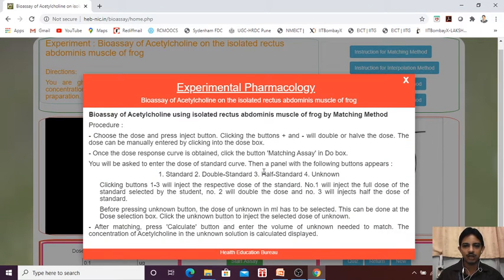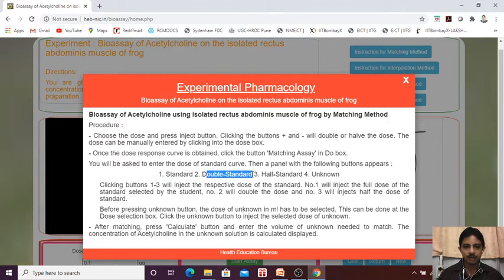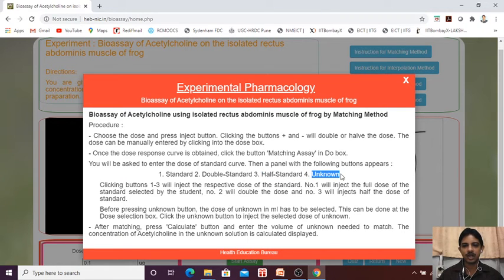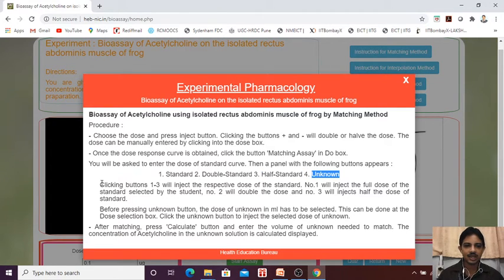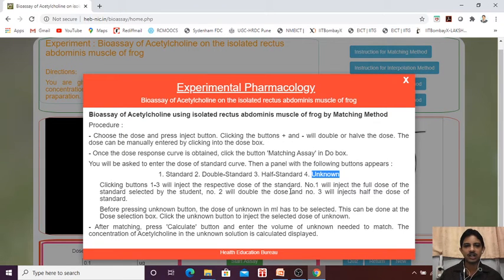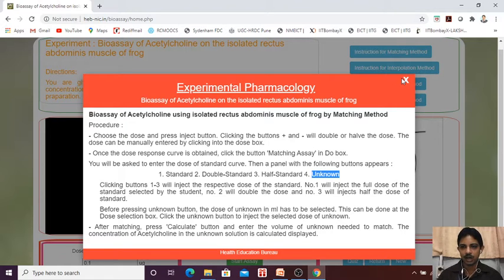Then you will from that panel, we can find that standard, double standard, half standard and unknown. You can alter the doses and by altering you can calculate it. Now we will see how we are going to perform it.